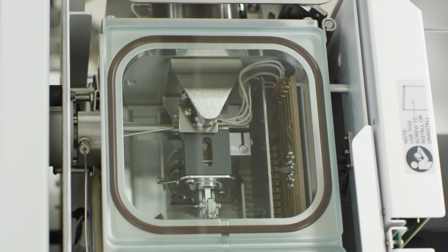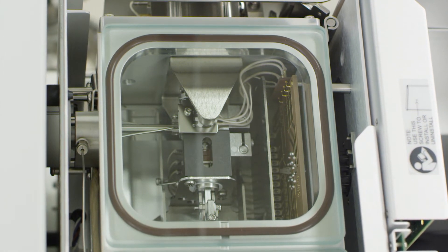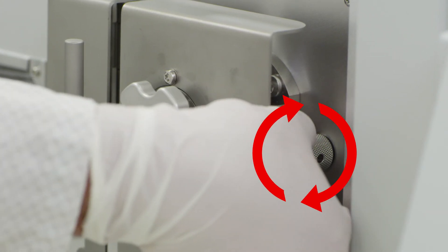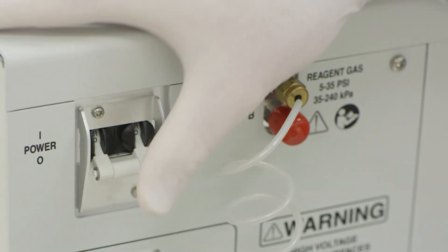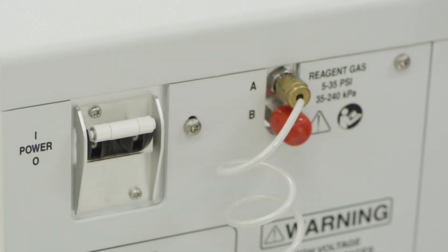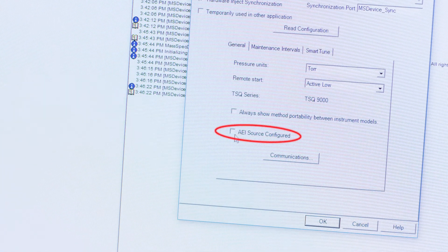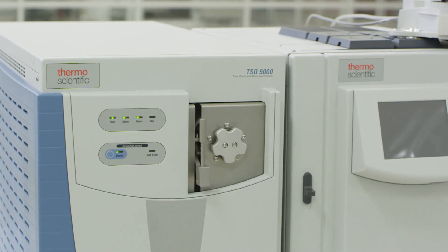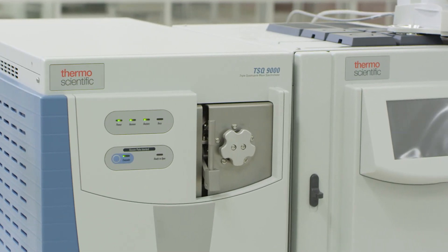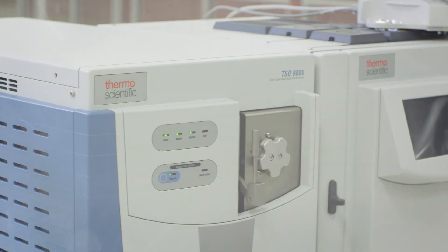Note, while the pump is achieving vacuum, you may have to place pressure on this piece of glass. Behind the manifold cover, locate and close the manual vent. Turn the power back on. Uncheck the box for AEI source configured and save the changes. The system is now configured with the EI source and can be tuned after equilibrating at the desired tune temperature for at least one hour.